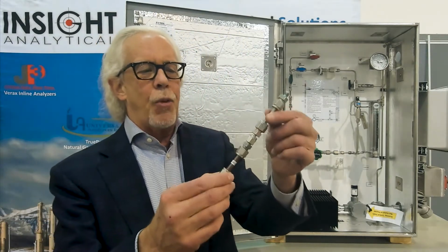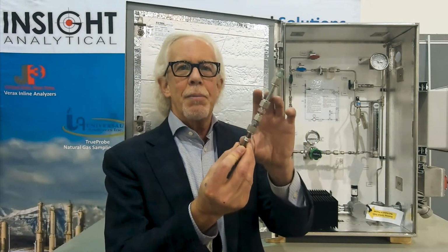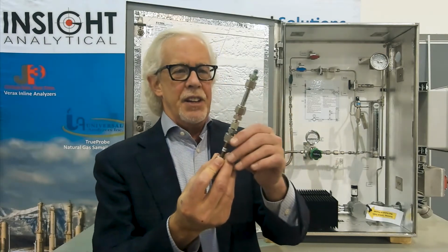The difficult part is the concentrations are quite low, often in the parts per billion levels. So Insight Analytical worked with Alberta Sulfur Research, and we've come up with a method that can be used to measure dithiazine concentration in natural gas pipelines. It involves the use of an absorbent trap. This trap contains a chemical that will absorb dithiazine. We can get it in the lab and release that dithiazine again.